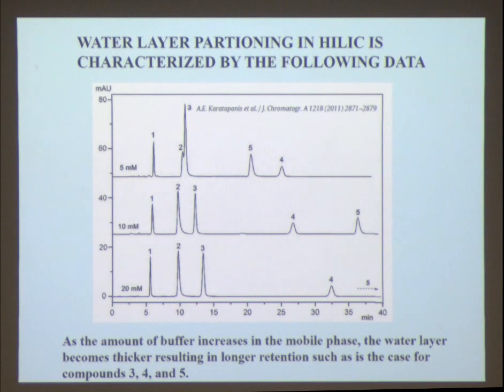People have been working with the ordinary silica materials, referred to as HILIC, for a while, and they've come to the conclusion that the mechanism of retention for these materials is a partition between the mobile phase in general and this very thick water layer on the surface. It's more polar than a mixture of, say, acetonitrile and water. Pure water is more polar. So the polar compounds are attracted to this thick layer of water, and they partition between the two. That's been the generally accepted mechanism.